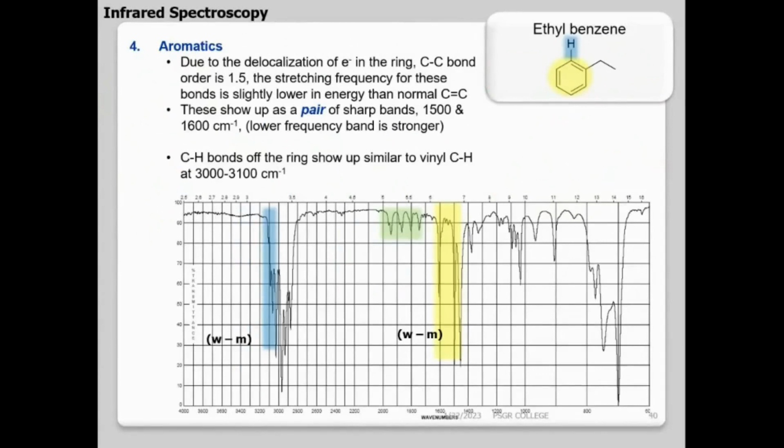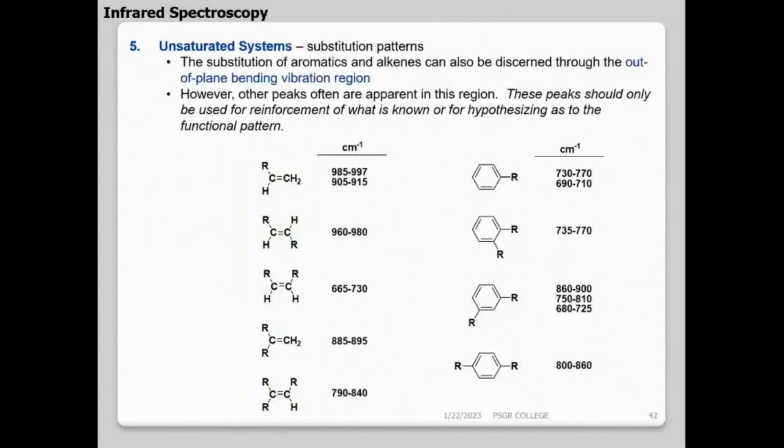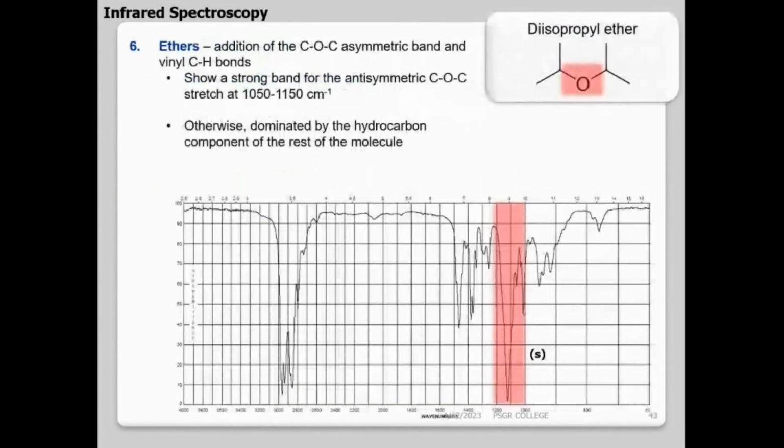Then benzene is like an alkene, we don't need it. Okay, then comes your ether. Generally when I talk about CO, where all does it come? I want quick answers. Where does CO come? Carbonyl compound, ether, ester, anhydride.